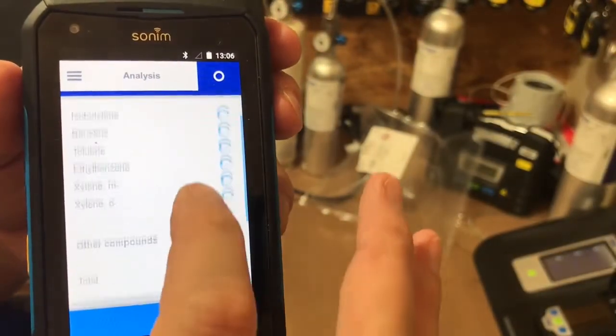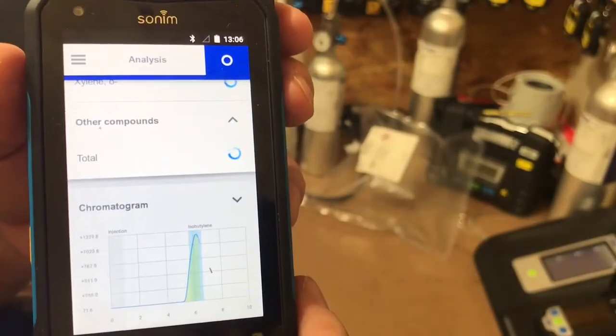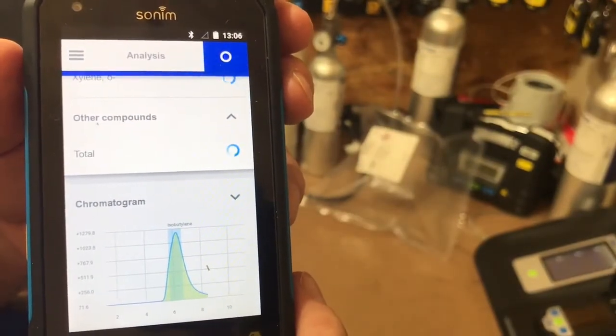Now you see everything running here — let's go down to the chromatograph so you can watch it. Spiked out of isobutylene.